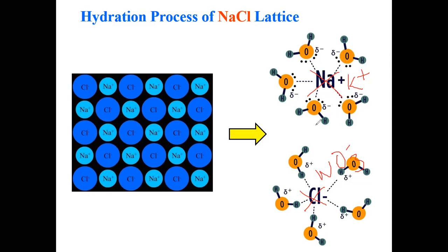Later on, we will calculate how much heat or thermal energy was absorbed during the potassium nitrate dissolution, or how much energy was released during the sodium hydroxide solvation. We will calculate the enthalpy. Earlier, you calculated the enthalpy for a reaction, del H. Here, we will calculate del H for the solvation process.